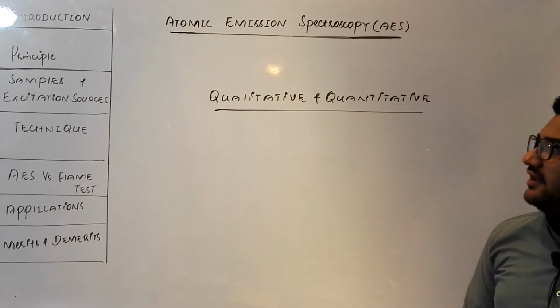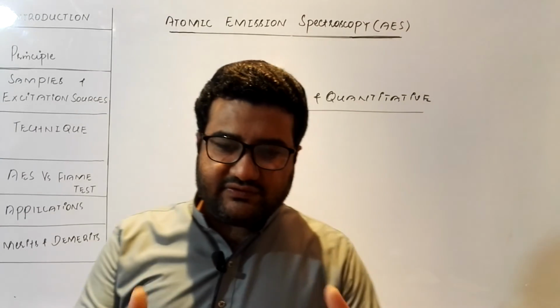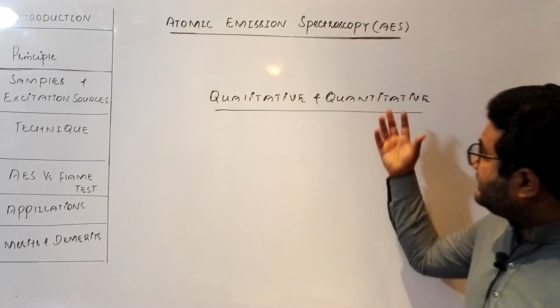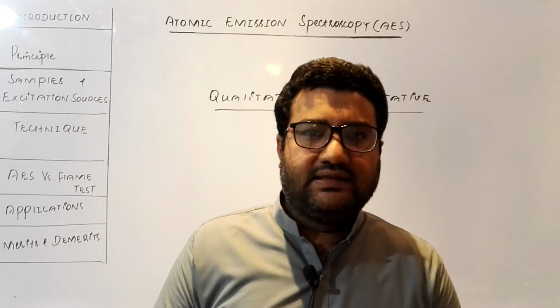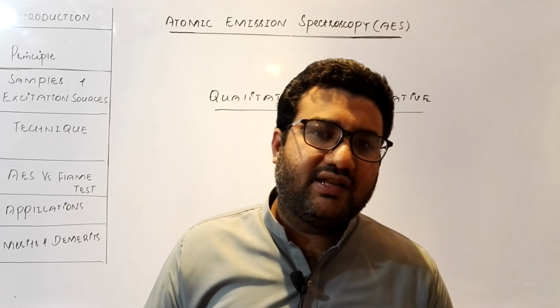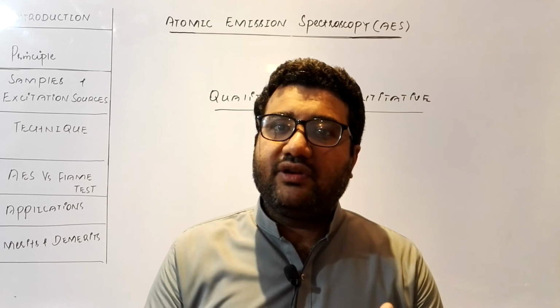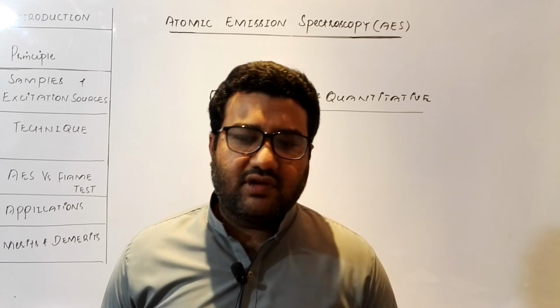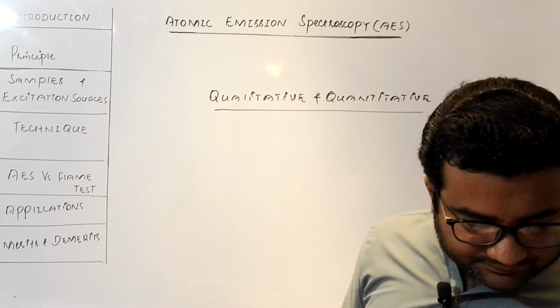When I say that it is qualitative, it means that by looking at the atomic emission spectrums and the patterns of the spectral lines, I can identify the elements, especially metals. How is it quantitative? By looking at the intensity of the photons released during the de-excitation of the electron, I can judge how many atoms of this metal there will be in the sample. So by looking at the quality of light, qualitative analysis; by looking at the intensity of light, I can judge the number of atoms of a specific metal in the given sample.